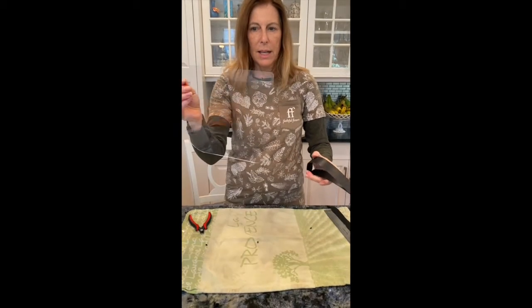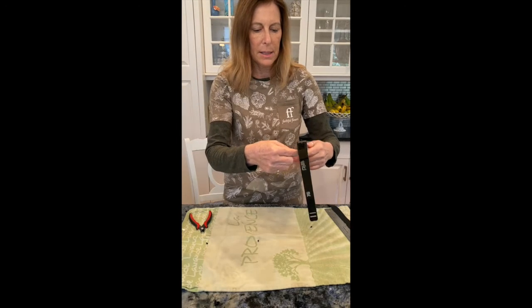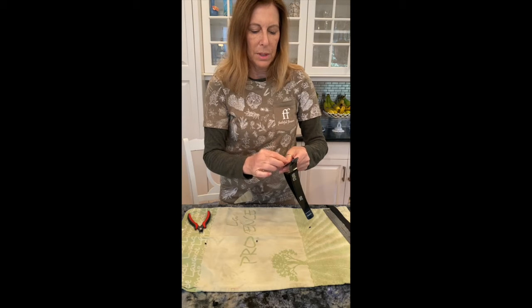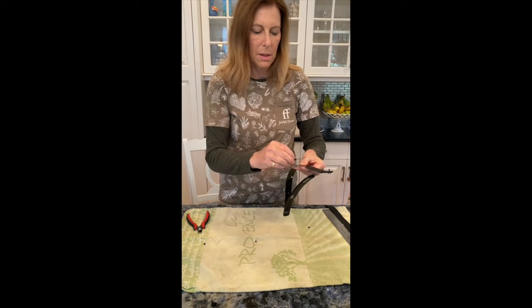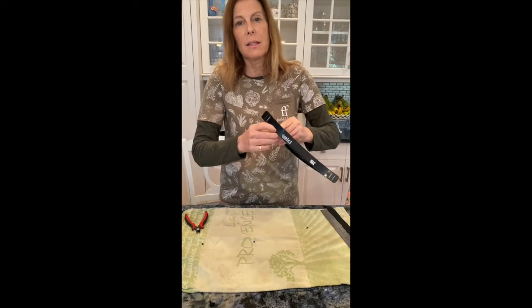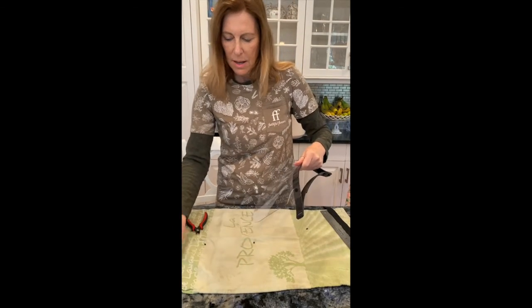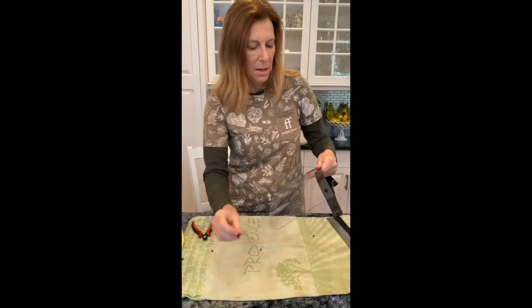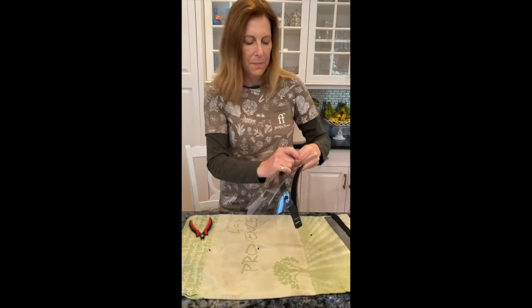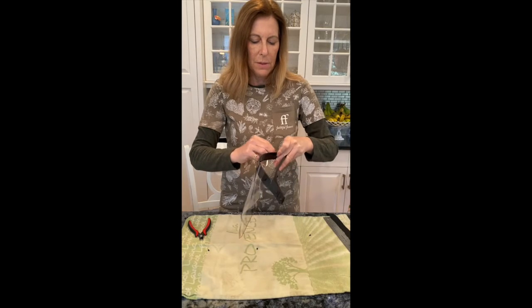Then you're going to take your sheet of plastic and put these right through the holes. Sometimes without glasses it's hard to find. Another little thing here, and we're almost done with the very first face shield.